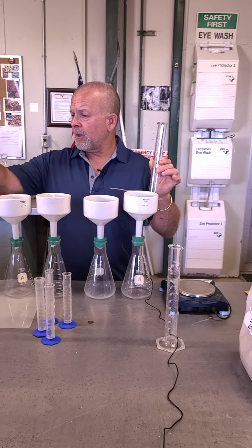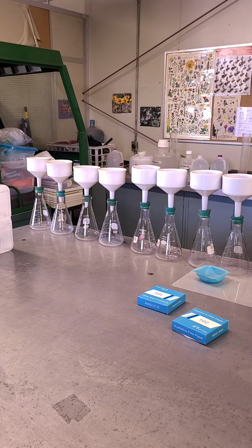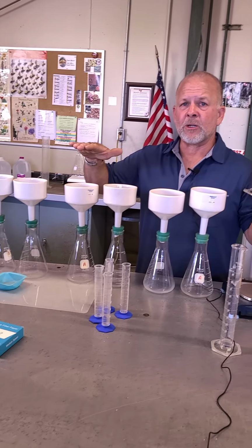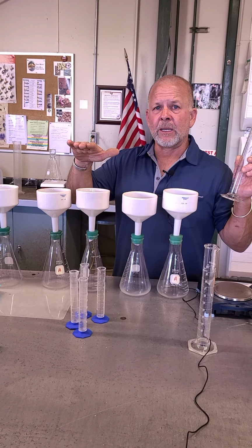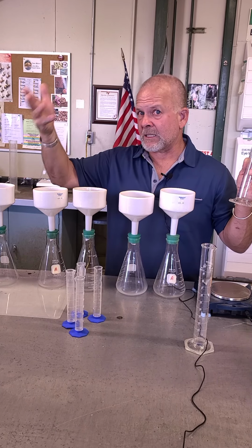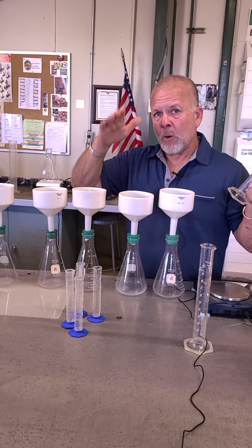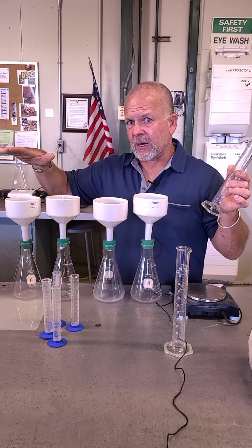I'm going to fill up deionized water in the other 2 sample sets, and then I'm going to go back and put each one of the different treatments in that. No sense for me videoing that, but when we come back and get all those, preparing the soil for the salts, if you will. That's actually what we're doing. We're applying our treatments to the soils right now.